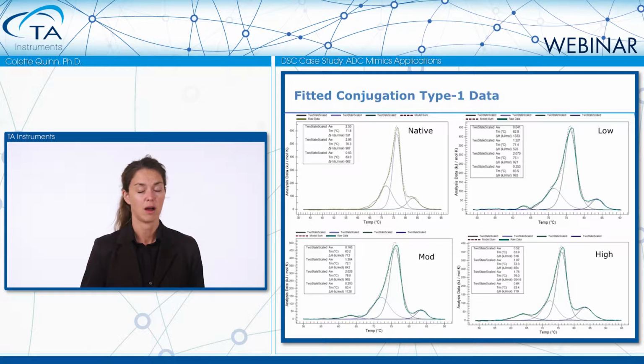Either we're having unfolding of the protein, and we just flat out don't have as much antibody available, which is going to be a problem later on if we're talking about dosages, or we've actually just broken apart a lot of the bonds that actually held this antibody together. So it's one of two things that could be occurring here, but with this large percent enthalpy change, it's more likely that we had some denaturation of the antibody during the preparation step.